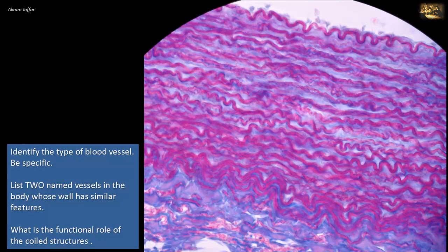For this, identify the type of blood vessel, be specific, list two named vessels in the body whose wall has similar features, and what is the functional role of the wavy and coiled structures.